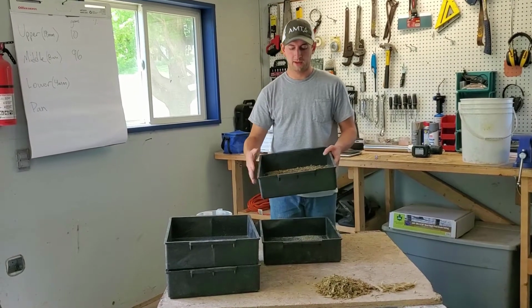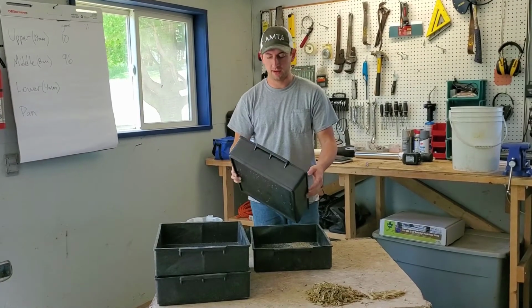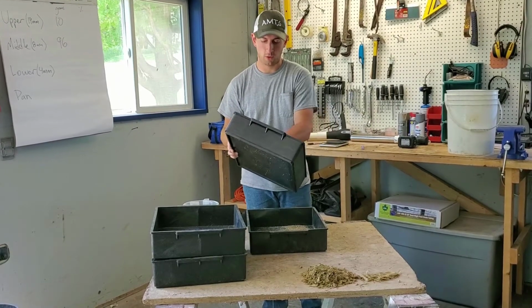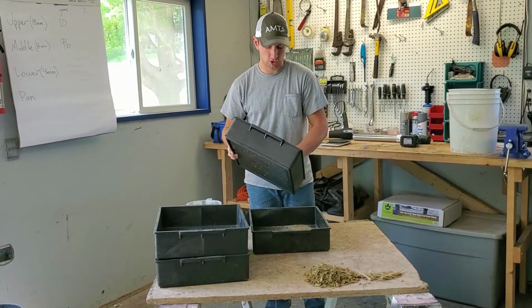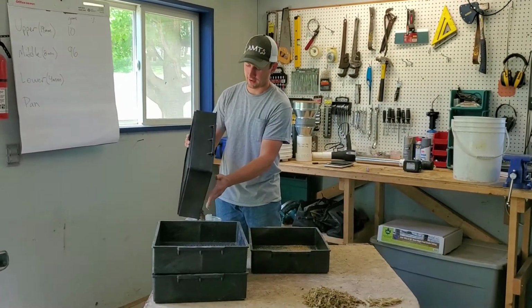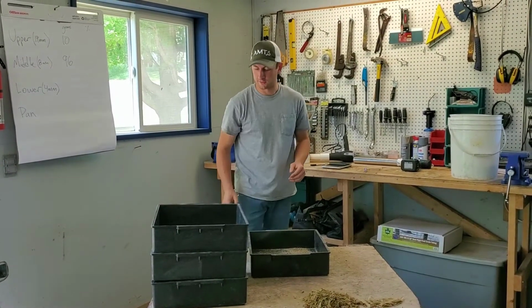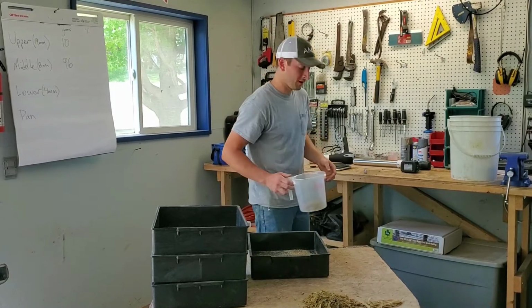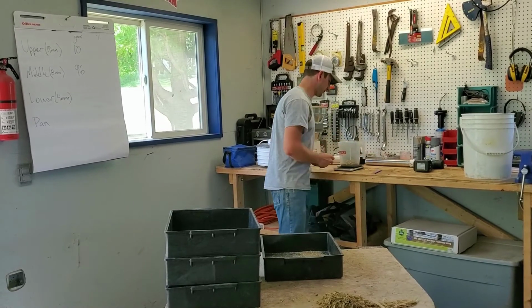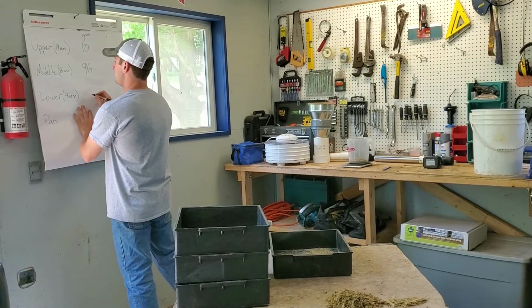This is the 4 mm pan. Anything from here and above is what we're actually going to use for our estimation of peNDF or PEF factor. Here is a good place as well to make sure you don't see any corn kernels. If you see corn kernels, you actually should try to remove them so that they don't get added in, because they don't contribute to the PEF factor at all. It's also a good way to have a conversation with your forage harvester runner, or the custom outfit. Here we are at 50 grams.